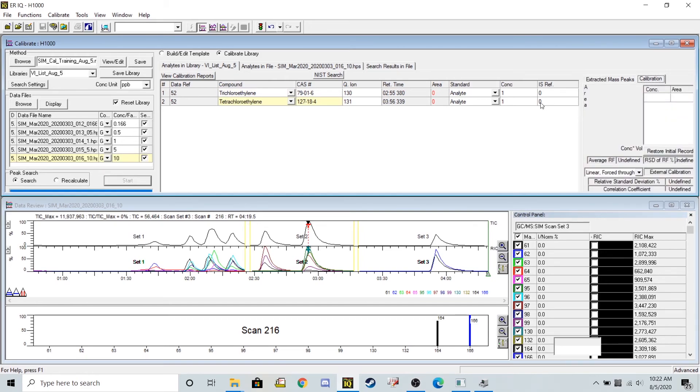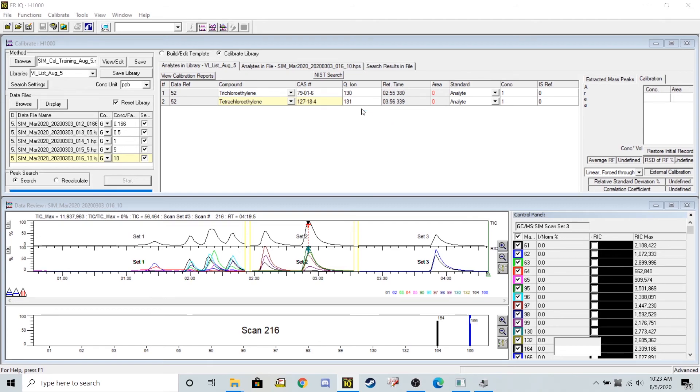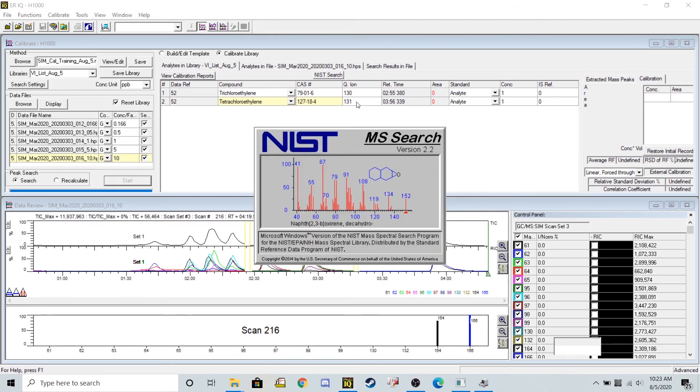If you think back to the masses that we input for tetrachloroethylene, it was 166 and 164. If I look up tetrachloroethylene in this, I really want to change this q ion to be our primary ion in that spectrum.